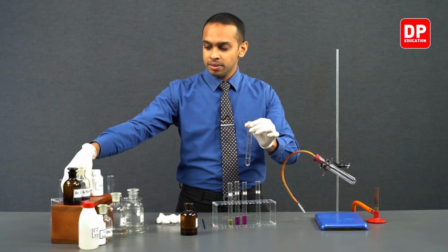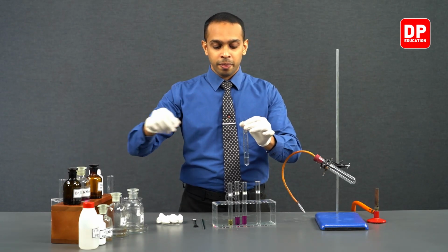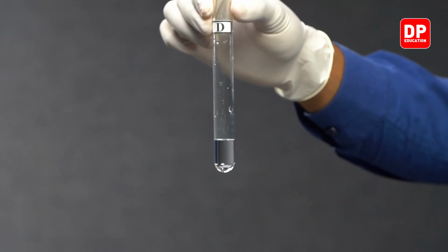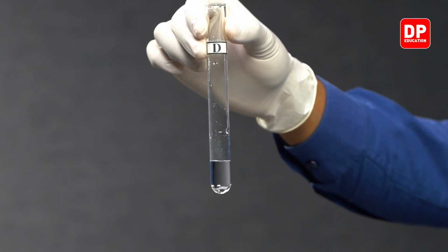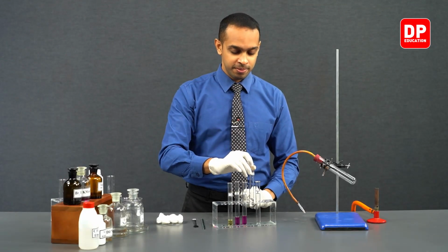We have taken ammoniacal silver nitrate or Tollens reagent into this test tube. You can see it appears clear here, and what you have in test tube D is ammoniacal silver nitrate, or in other words, Tollens reagent.